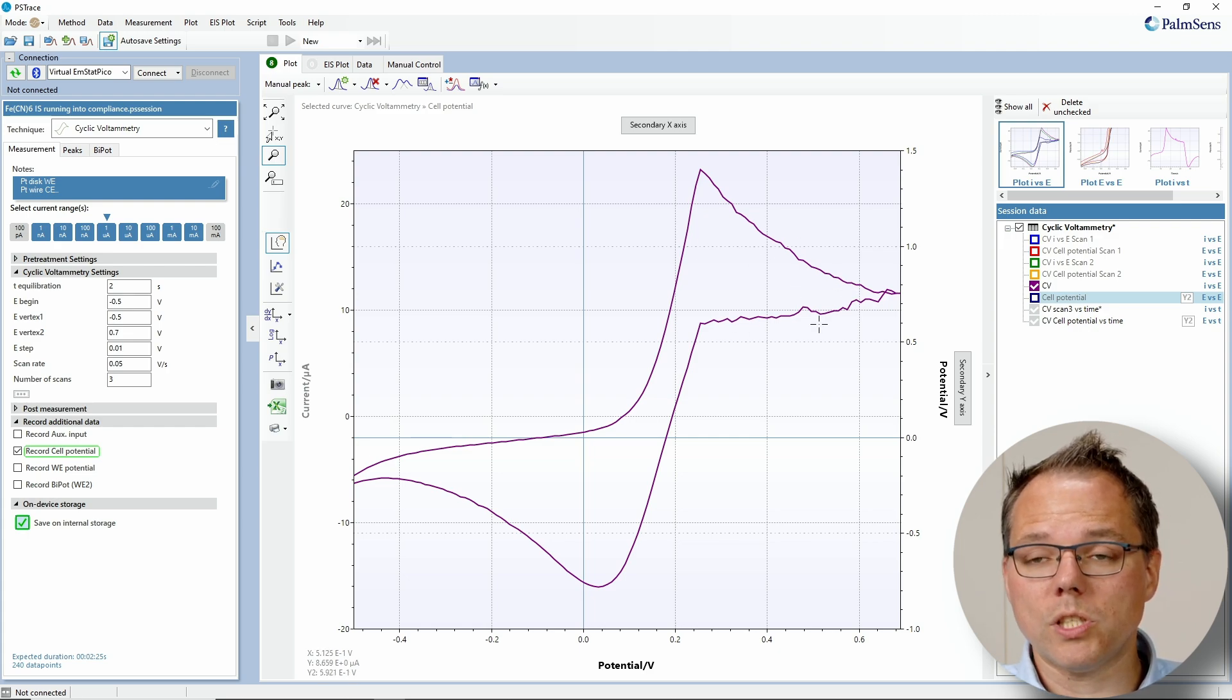I wonder, did I run into my compliance voltage? An easy way to find out is if you have one of our newer devices like the PalmSense 4, the Emstat 4, or one of the Sensit devices, you can just click on record additional data and choose to record the cell potential. And this you need to do before the measurement, and then during the measurement you will record the cell potential.